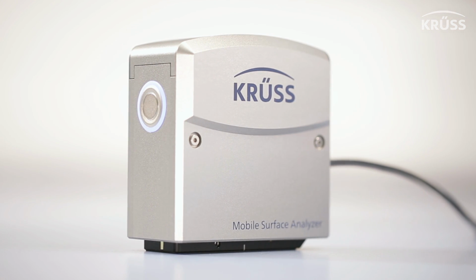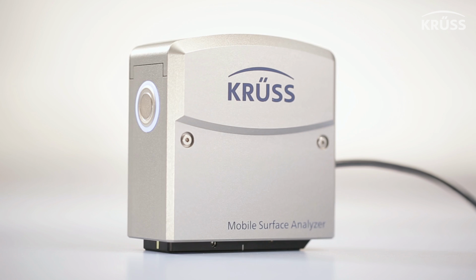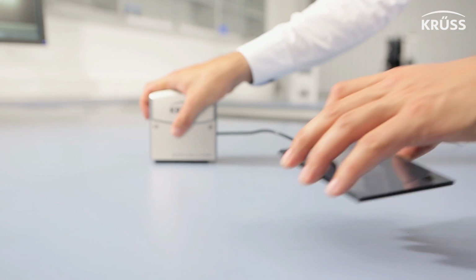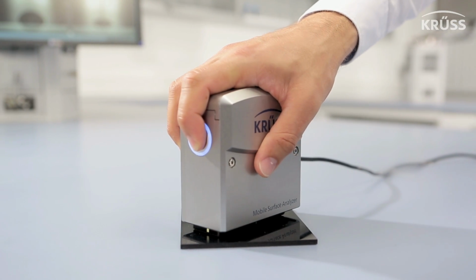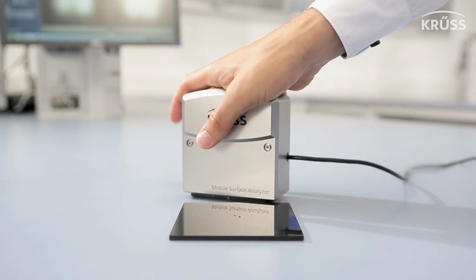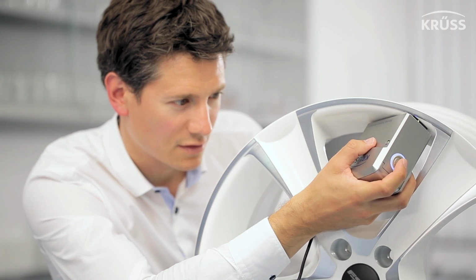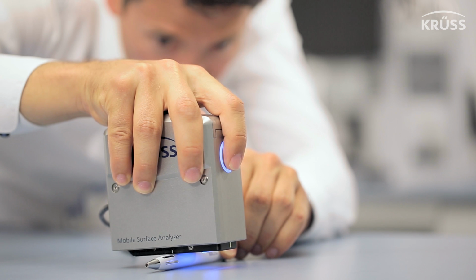Introducing the Mobile Surface Analyzer, MSA, the world's first automatic mobile surface-free energy tester that fits in your hand. With the click of a button, two drops with different polarities are dosed and analyzed in less than 1 second. Even overhead, or on small convex parts like a pen.